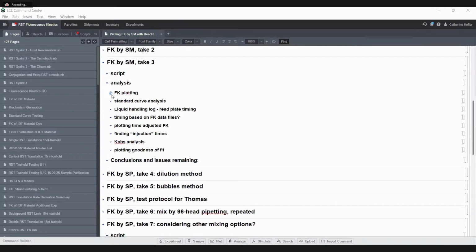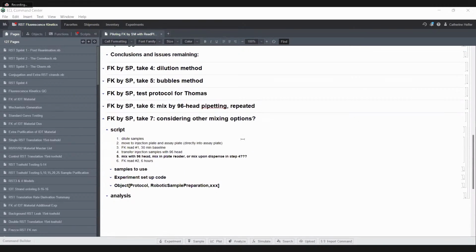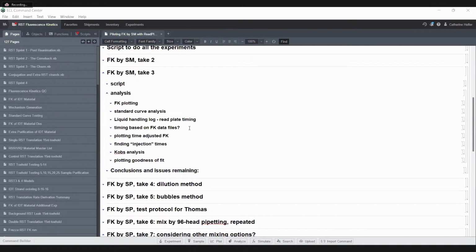Let's do the fluorescence kinetics. It's the model system I was trying to pitch you on in that email that we could use to show. Okay, let's see that. That would be great. So the data analysis or running of the experiment? Well, do both. Show the command that was used to run the experiment, then the data you got and the analysis and the fitting you do.